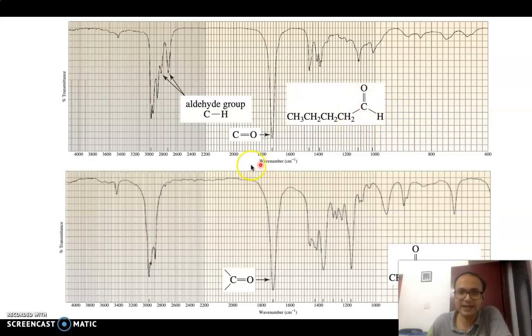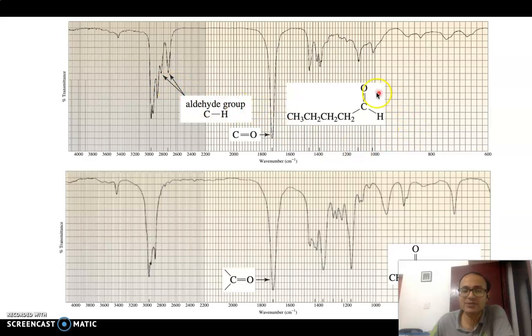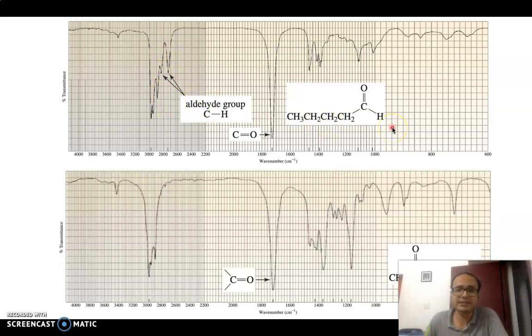Whenever your compound is an aldehyde, apart from the C=O stretching, you will find two characteristic peaks: one at around 2820 cm⁻¹ and another at around 2720 cm⁻¹. You can clearly visualize these two peaks and therefore identify the presence of aldehyde. In this region of 2820 and 2720 cm⁻¹, you do not see any other peaks corresponding to any other functional group, so this is very characteristic for identifying aldehydes.